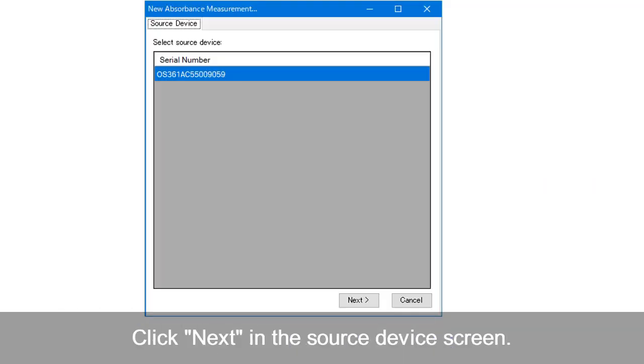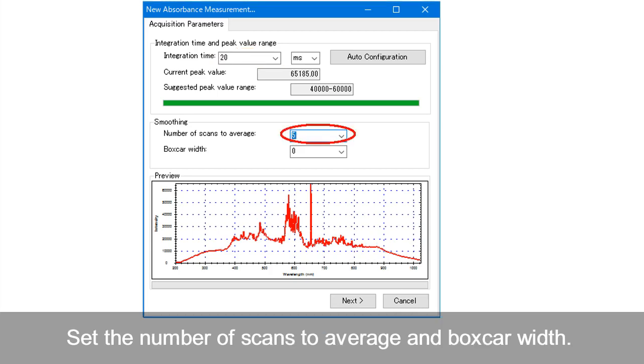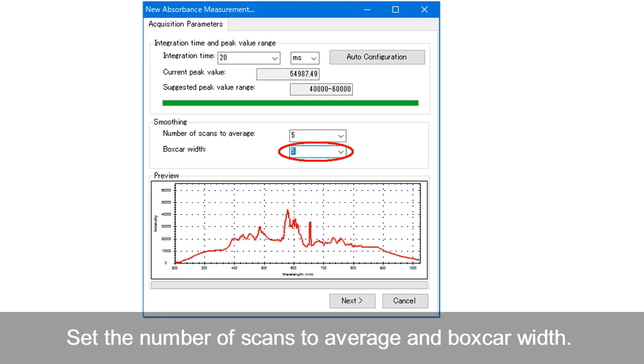Click Next in the source device screen. In the acquisition parameters, set the integration time so that the peak is within the recommended peak value range. For the smoothing of the spectrum, set the number of scans to average and boxcar width. Click Next.